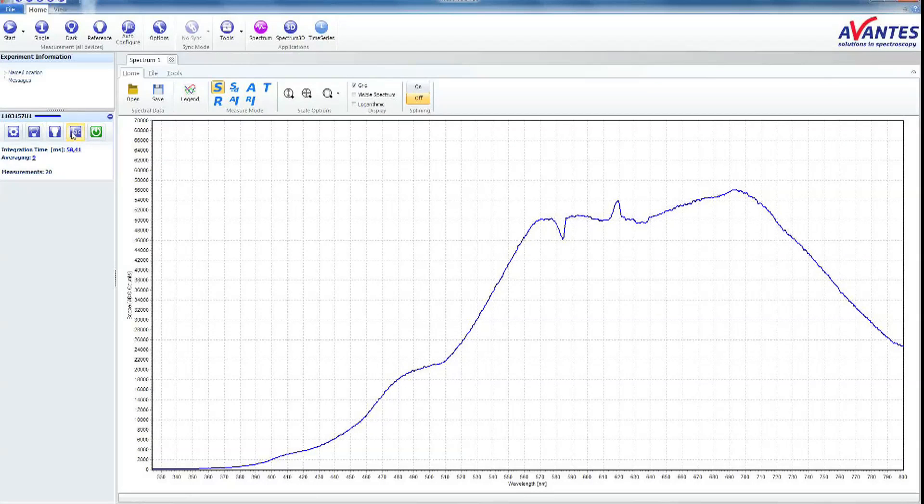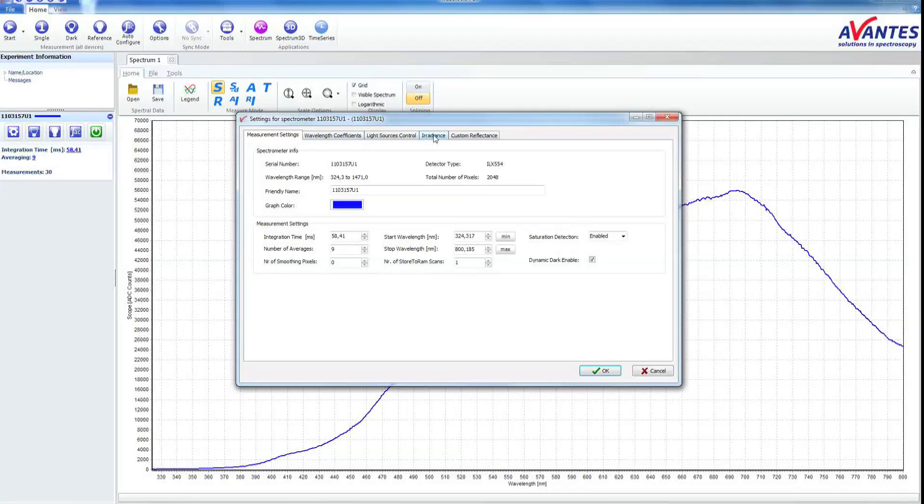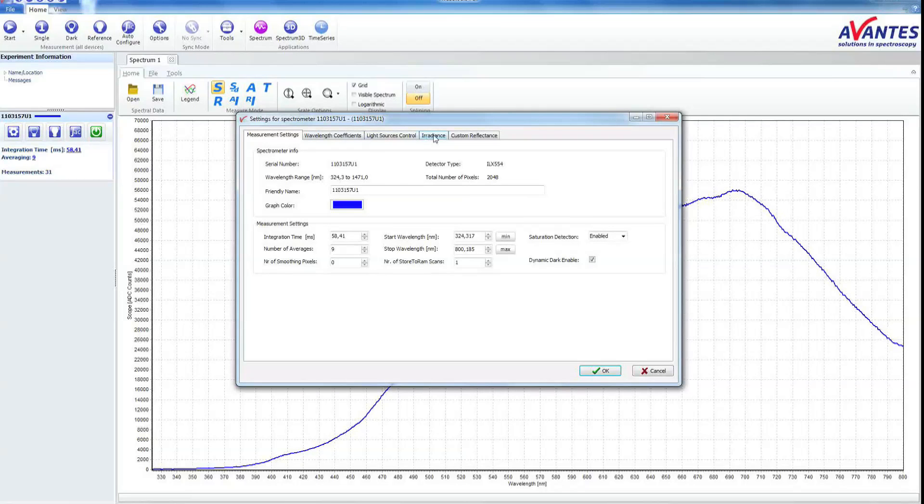Click the button Spectrometer Setup in the Spectrometer menu. Go to the Irradiance tab and continue by clicking the Perform Intensity button.